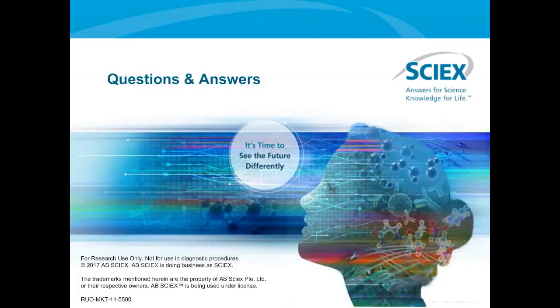Do you use a coated capillary in the CE separation? No. Okay. And classically, glucose unit values for HPLC have been measured against a dextran ladder, not a malto-oligosaccharide ladder. Why did you change?